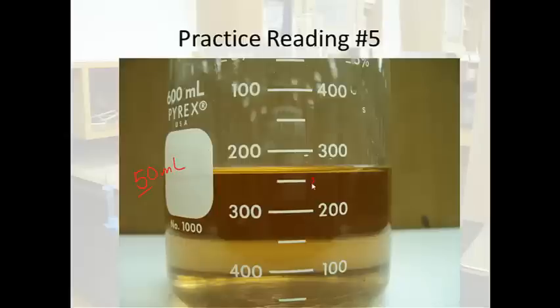So when I say 200, it's 250 here. The meniscus is right here. Halfway would be 275, right? So that's halfway. Maybe 260-ish, or some people might say 270-ish. So somewhere between 260 and 270 is probably right. I'd say even 260 to 265 would probably be the best guesses. And don't forget your units of milliliters.